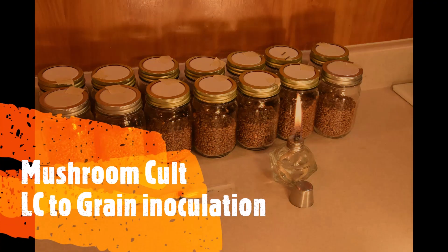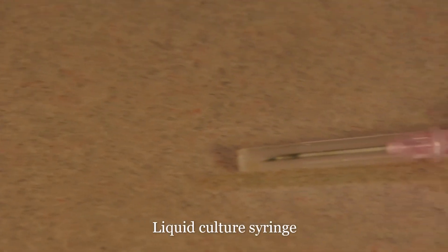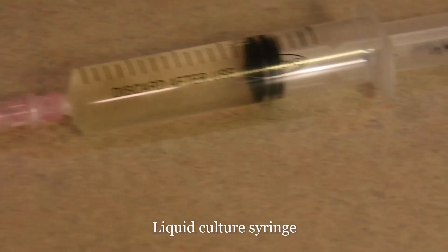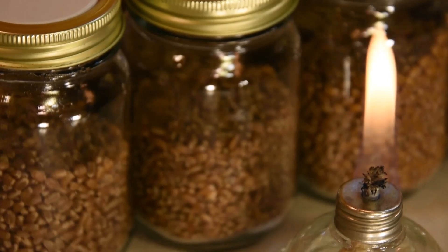Welcome to the Mushroom Cult Liquid Culture to Grain Inoculation demonstration video. This video is designed to give you an example of one way that you can inoculate grain with liquid culture. We will be using a syringe that has Pleurotus Citrinopileatus mycelium suspended in nutrient liquid.